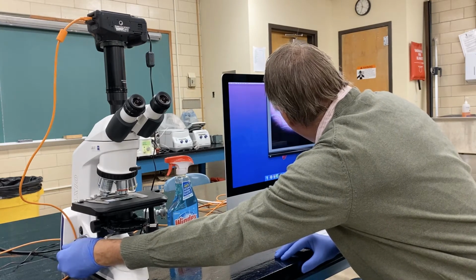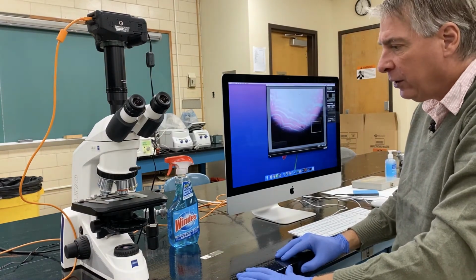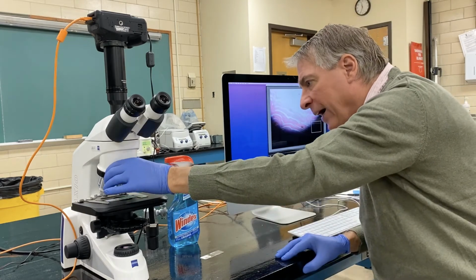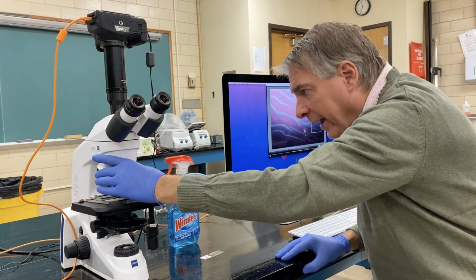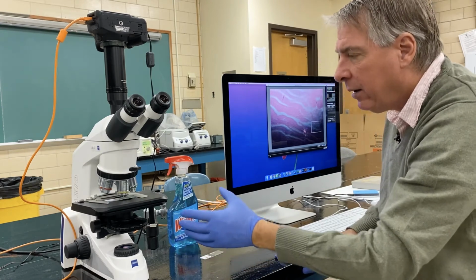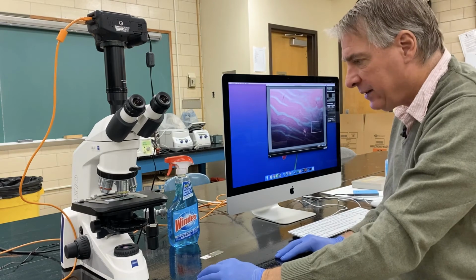It's a little difficult because the light isn't centered correctly. So to achieve Kohler illumination, I'm first going to move the objective from the 5x objective to the 10x objective. Kohler has a much more profound effect on the higher magnification objectives than the 5x. So I'm going to start with the 10.